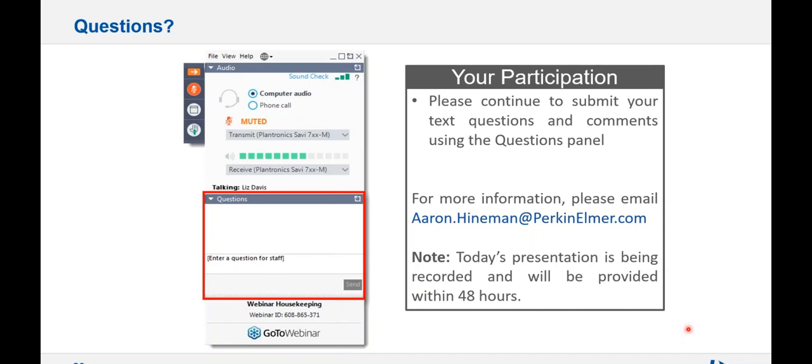I need to test borate. Do you think AA is good for boron in terms of selectivity and sensitivity? I'll let you answer that. I mean, perhaps. We kind of need to know concentrations. Please reach out to us with more information there.